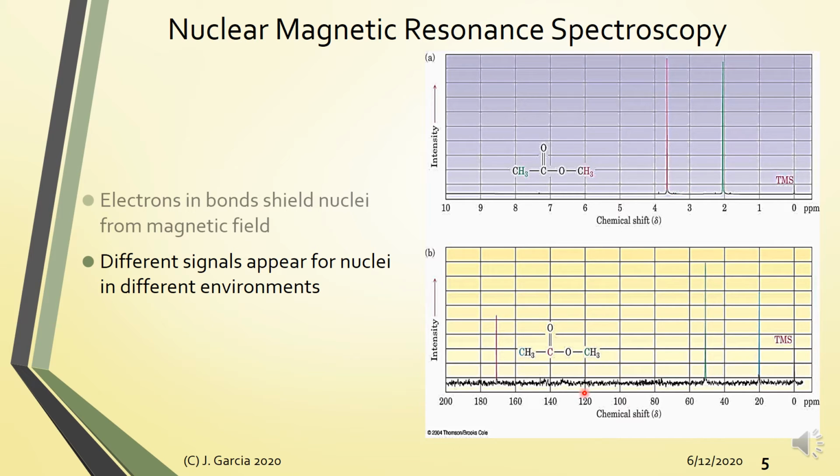The same is true with carbon-13 NMR. For proton NMR, you have two signals because you have two different proton environments, or basically two different protons in general. Whereas for the carbon-13 NMR, we have three different carbon environments. So, isang information yan na natin tignan.